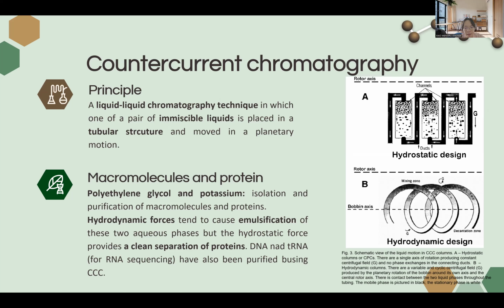Hydrodynamic force tends to cause emulsification of these two aqueous phases, but hydrostatic force provides a clean separation of protein. DNA and tRNA have also been purified using CCC. This is a schematic view of liquid motion in a CCC column.